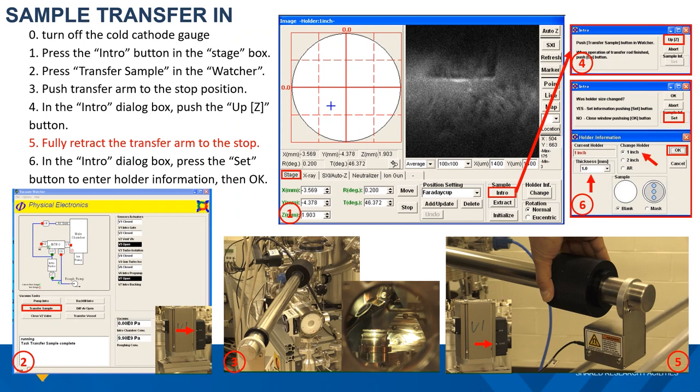Finally, go back to the intro window and click the set button. This will bring up the holder information window, where you will need to type in the sample holder size — in all cases it's a 1-inch holder — and the sample thickness information. For thin film or powder samples, it should be zero or one millimeter. This information allows the software to set a software limit for sample motion along the vertical direction, preventing potential damage. Then push the OK button, which will close the window. The sample is now in the main chamber and ready for further action.